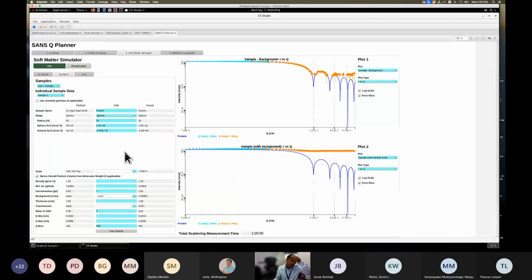So we have something called the simulator that Volker had developed in Excel, which got now moved on to the EPICS system, which controls our data acquisition. Right now, it's still setting up. We have started working on EPICS. We have to find a way for users to access this prior to coming. Right now, access is only after coming, or if you're remote, once your IPTS has kicked in. So it's not as well established for sharing with users, but that's our hope, that we'll get this out and users can test.